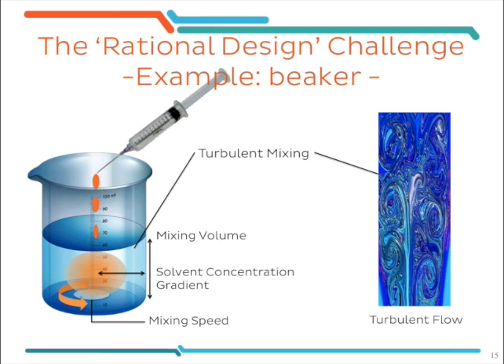And this concentration gradient has a poorly defined diffusion profile. Also, this concentration gradient changes the more organic solvent we add to the aqueous phase, and the higher the overall solvent concentration in the entire solution increases.